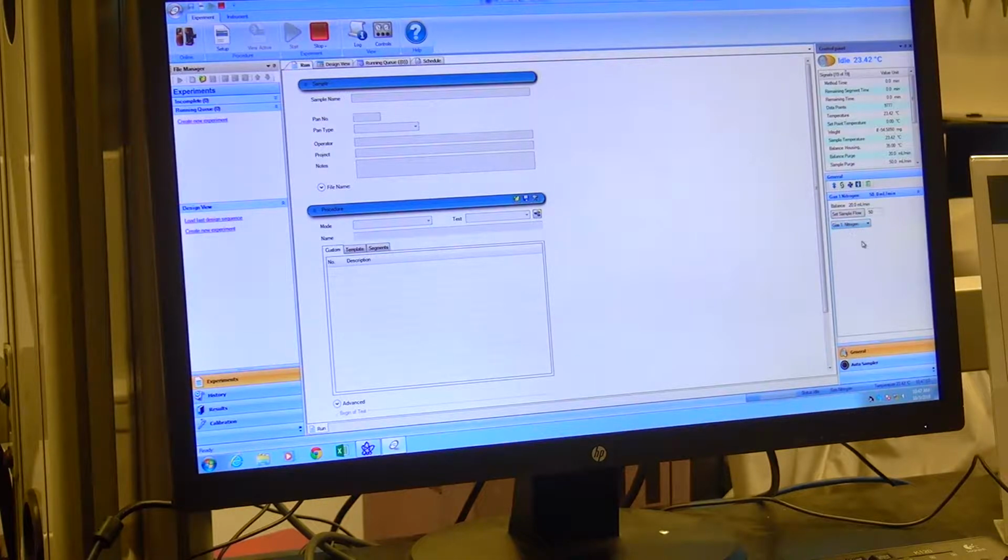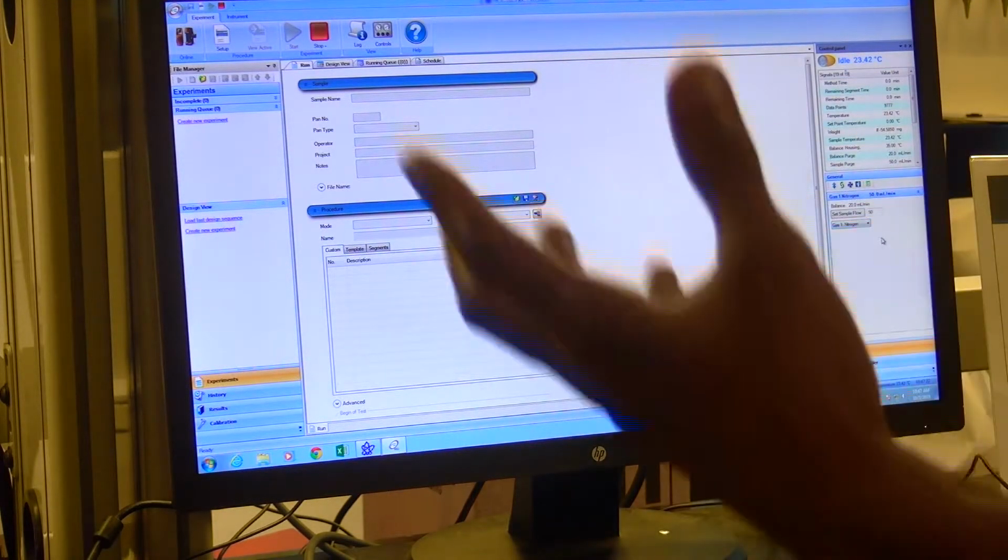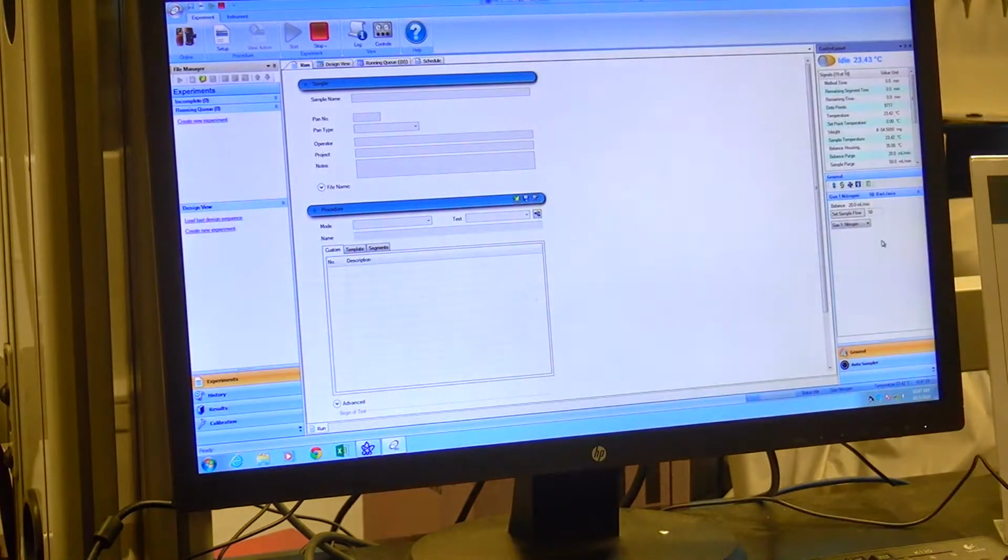All right. I generally ask people if you're running in air, when you're finished with the experiment, to please switch it back to nitrogen. Again, just because air is a reactive gas, so you don't want to diminish the lifetime of the instrument itself. So leaving it in standby mode on the nitrogen will sort of preserve everything. And therefore we have to do less maintenance and repairs and things like that as time goes on. So when you're finished with using gas 2, please try to use gas 1.